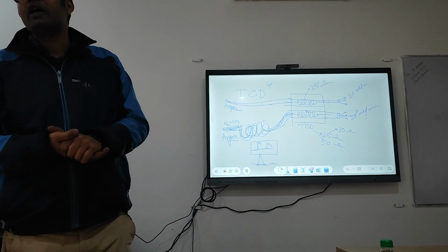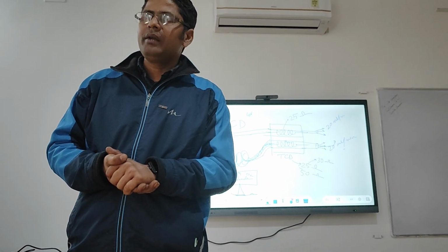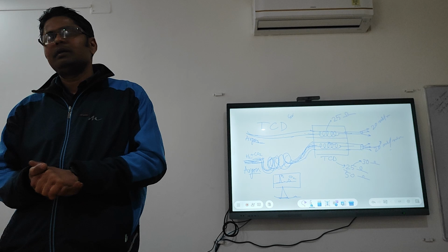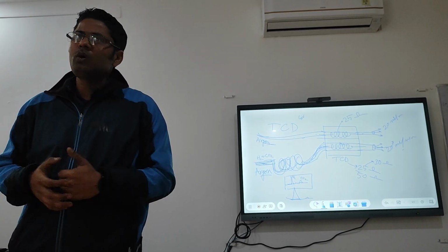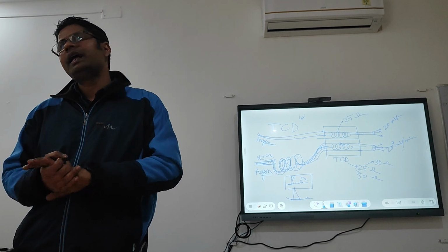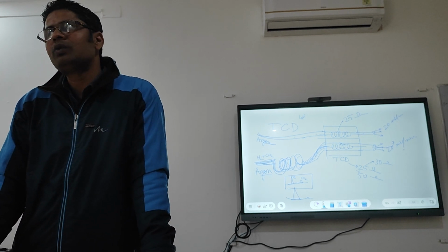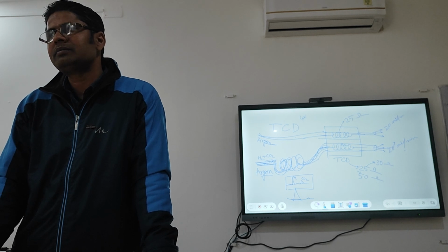Sometimes we use a combination of 2 detectors, TCD and FID. When we have a sample with hydrogen, oxygen, nitrogen, methane, CO, and CO2, the response is very small in TCD. Even if you are injecting 1% CO2 or CO, you will get a very small peak in TCD.